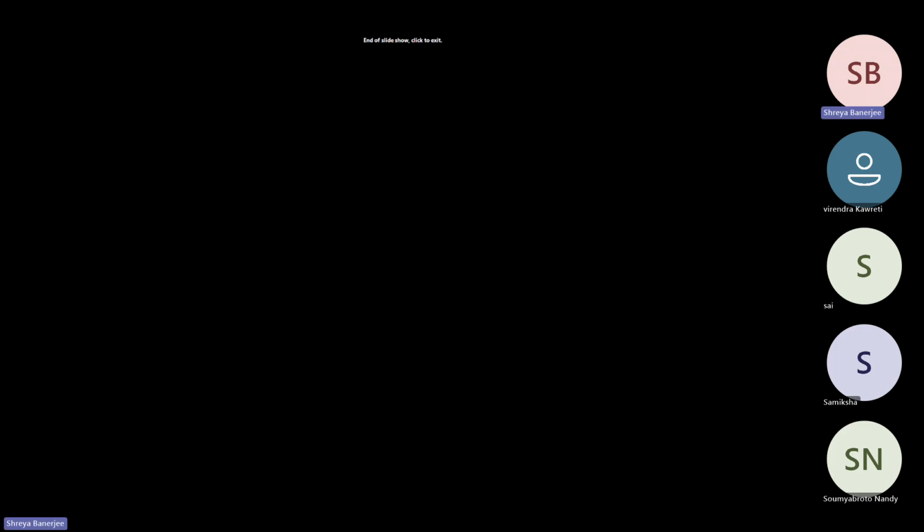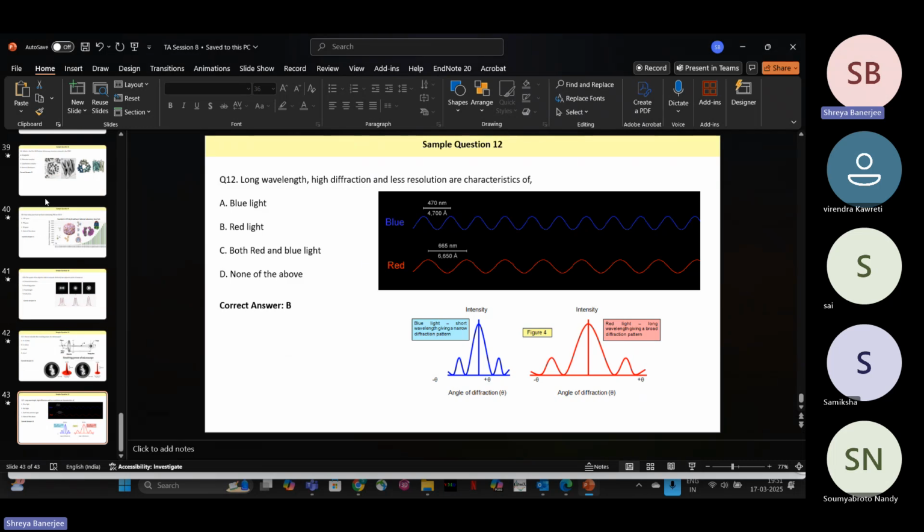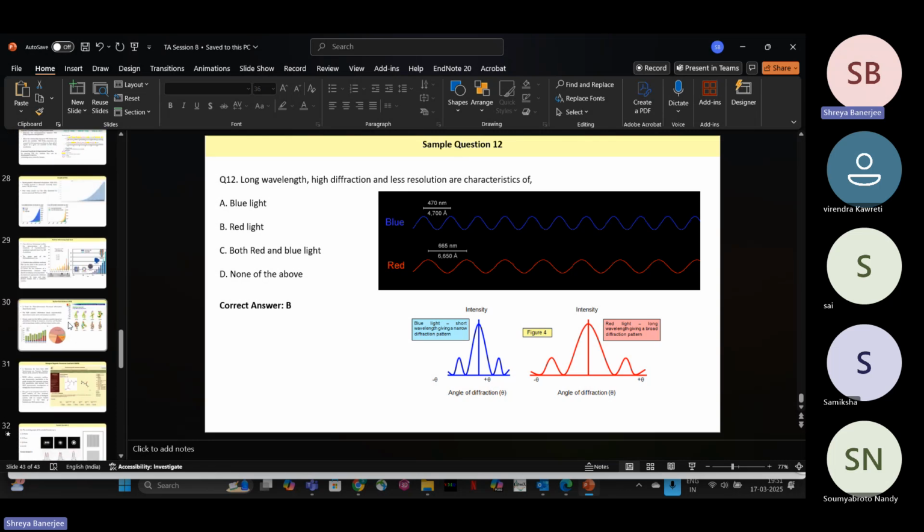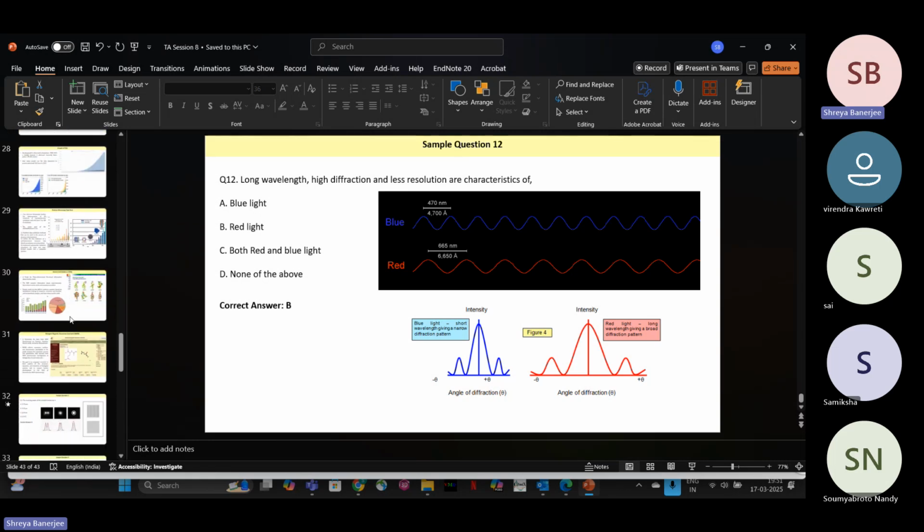So those are the questions I have for today. Today I've mostly covered, I started from light microscope, then compound microscope, and then went into cryo-electron microscope. And in cryo-electron microscope, I discussed the different ways of sample preparation, the instrumentation, the detection, and finally the image reconstruction to get a 3D image. So that is what this class has been about.